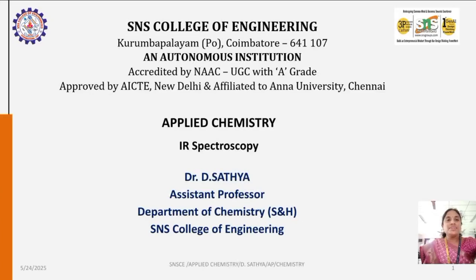I am Dr. Sathya, working as an assistant professor in the Department of Chemistry, SNS College of Engineering. Today we are going to discuss one of the absorption spectroscopy techniques. It's called IR spectroscopy.